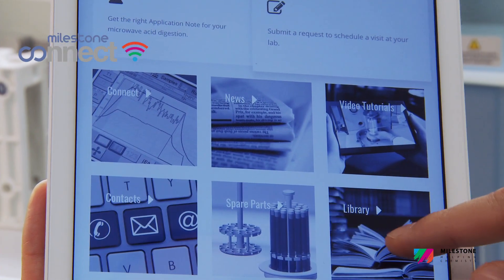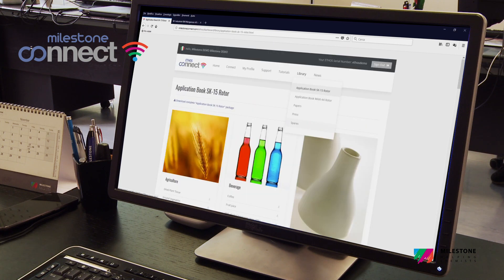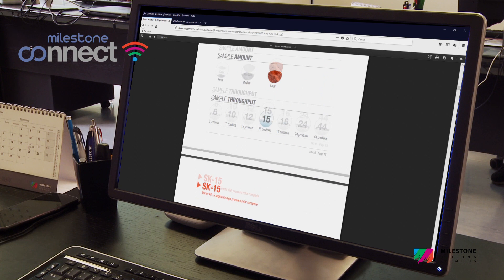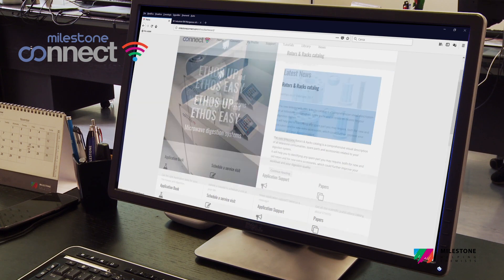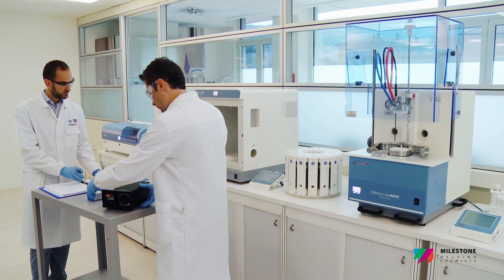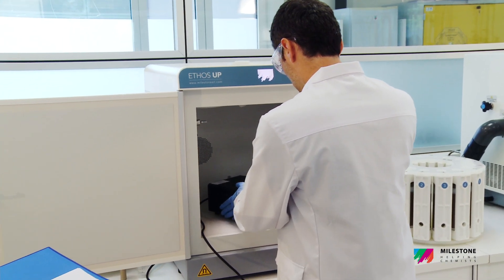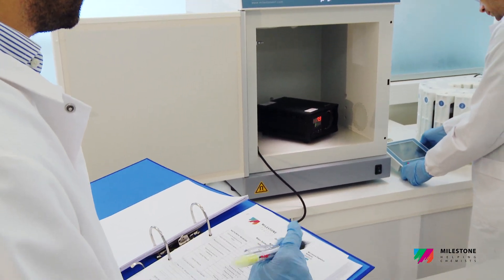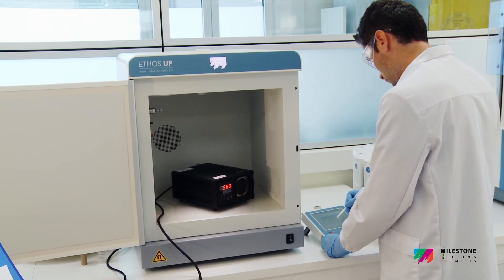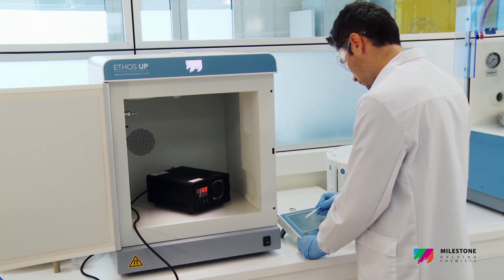Milestone Connect provides access to exclusive resources such as application notes, scientific papers, tutorial videos and the spare parts list, ensuring 24-7 support and the capability of remotely controlling the system. Matching regulations is crucial in many industries such as the pharmaceutical one. That's why Milestone offers a comprehensive Milestone Validation Package to quickly implement the instruments in the lab.